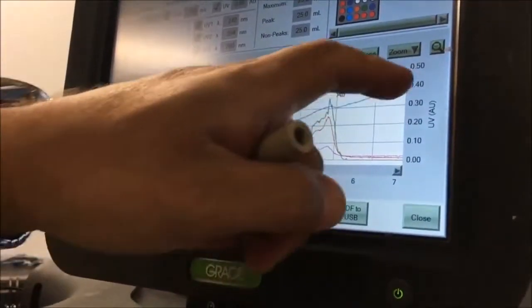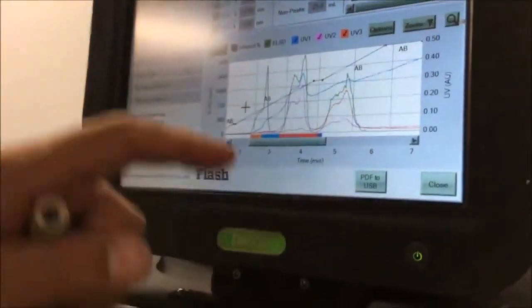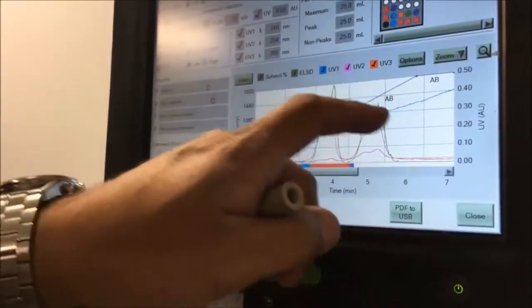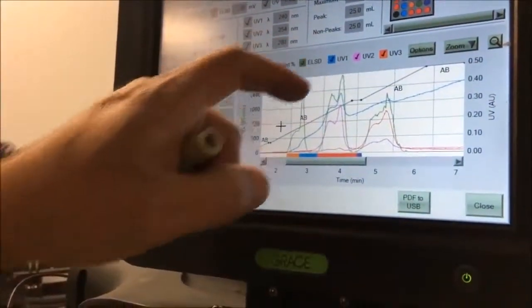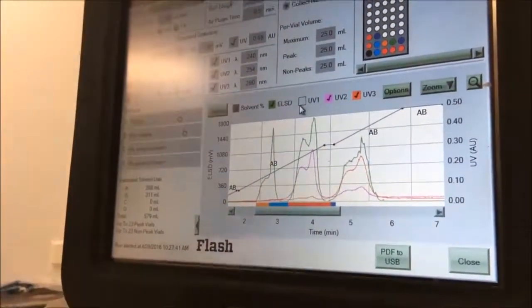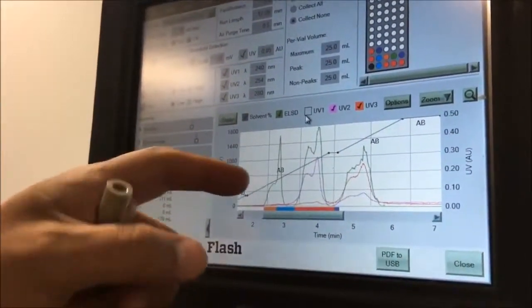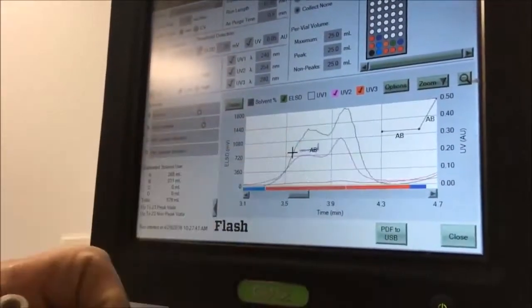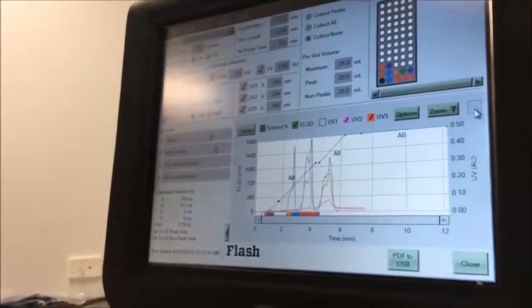Now that blue line is absorbance of ethyl acetate. That's why the instrument continued the 5-minute run. It's calling it a signal, but it's not a real signal, it's the solvent. So we should have selected a higher wavelength. From here you can actually go into detail of the peak by zooming again, and then just zoom back out.